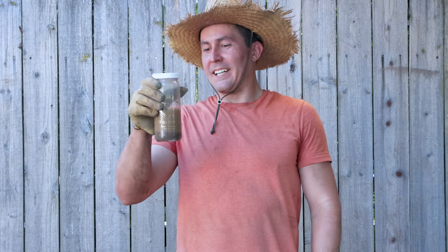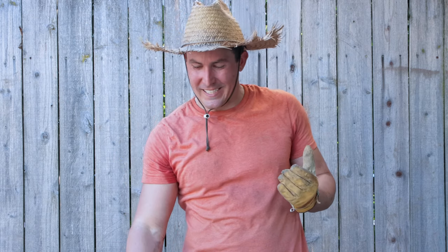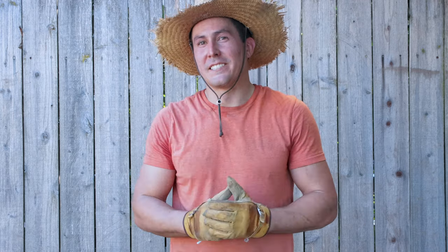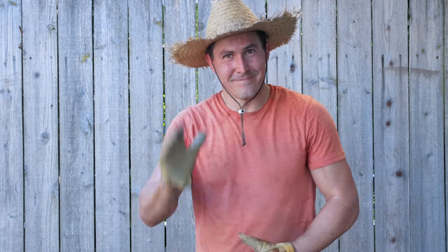Hi, I'm Kyle from the future — it's 24 hours later and this water still looks just as murky as it did yesterday. So I'm really glad I didn't wait. By the way, if I look a lot more dirty than I did yesterday, it's because today I am prepping that soil according to what I learned from all of these soil tests. So stay tuned for that video coming soon, probably about a week or so.